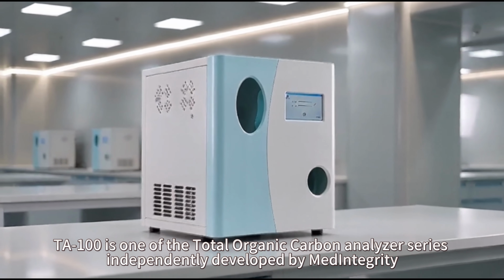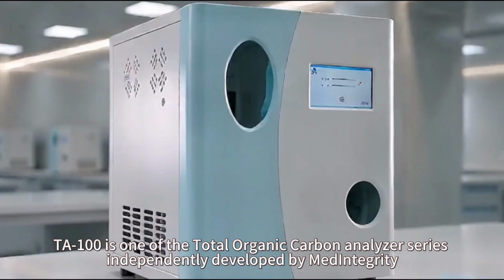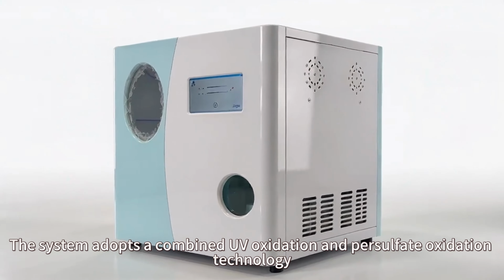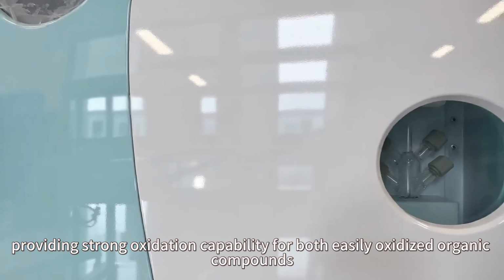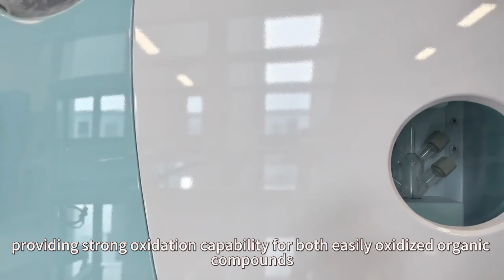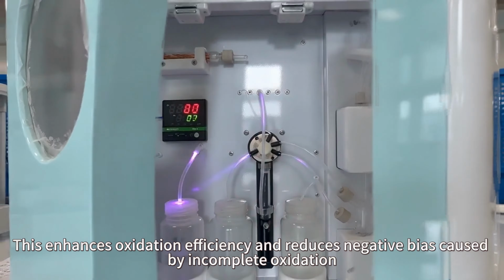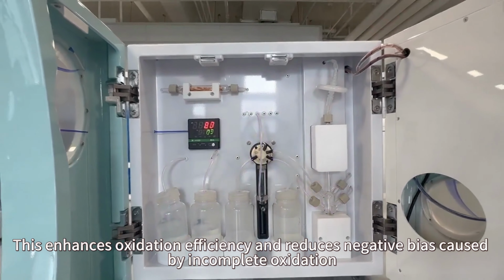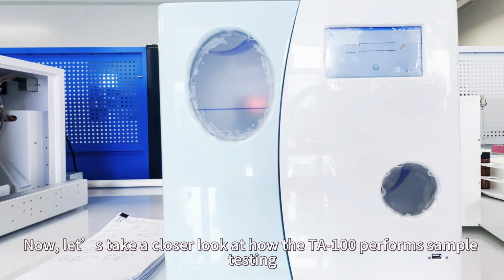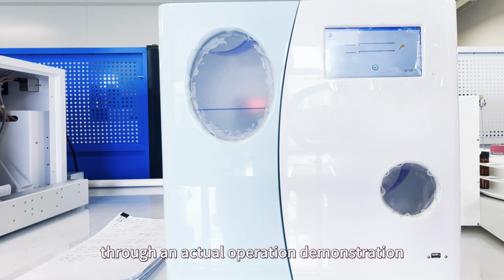TA-100 is one of the Total Organic Carbon Analyzer series independently developed by MedIntegrity. The system adopts a combined UV oxidation and persulfate oxidation technology, providing strong oxidation capability for both easily oxidized organic compounds and more resistant organic substances. This enhances oxidation efficiency and reduces negative bias caused by incomplete oxidation. Now, let's take a closer look at how the TA-100 performs sample testing through an actual operation demonstration.